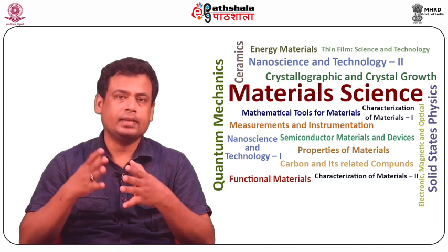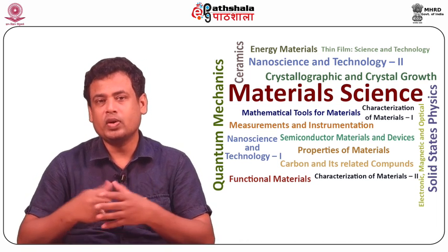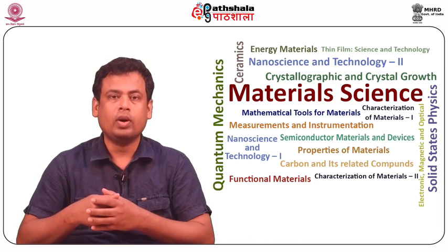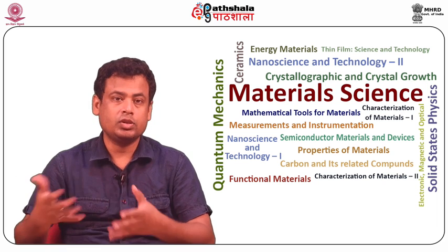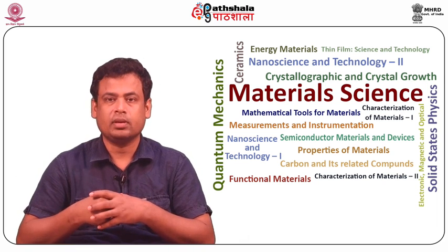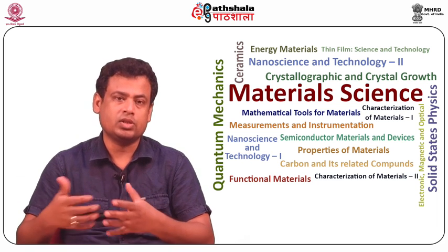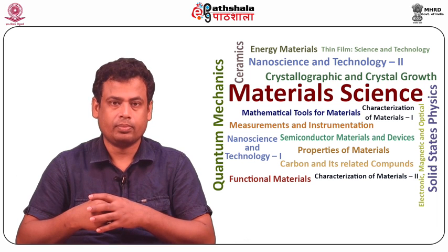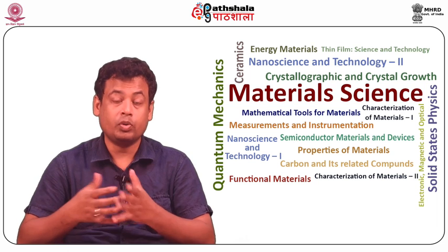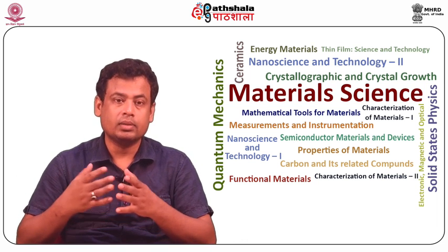Let us see what are the advantages of low voltage SEM. In low voltage SEM, where V is around 1 kilovolt, the electrons impinging on the specimen's surface with low energy penetrate a shorter distance through the surface, possessing a larger cross section and produce secondary electrons near the surface where they can escape.